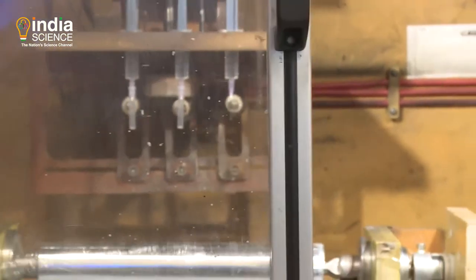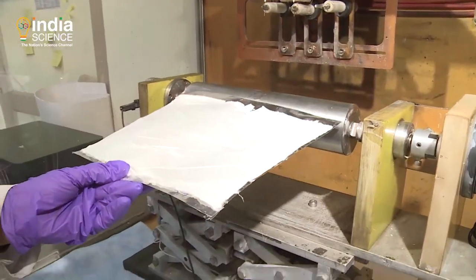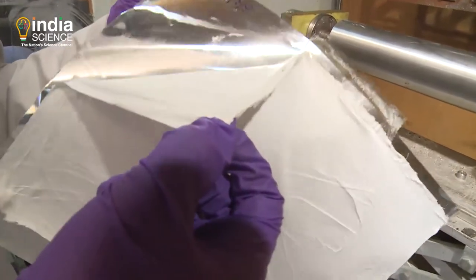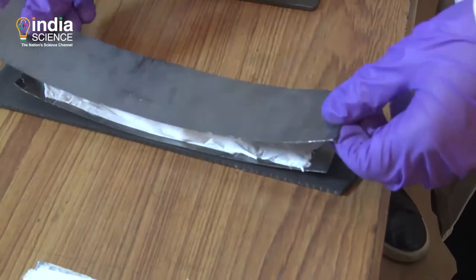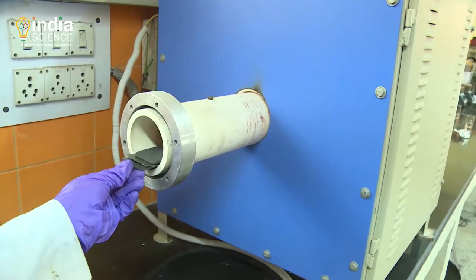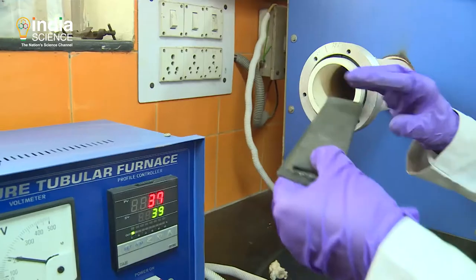The resulting nanofiber looks like a white sheet. These nanofiber sheets are then converted into carbon nanofiber sheets by carbonization at high temperatures of up to 2000 degrees Celsius.